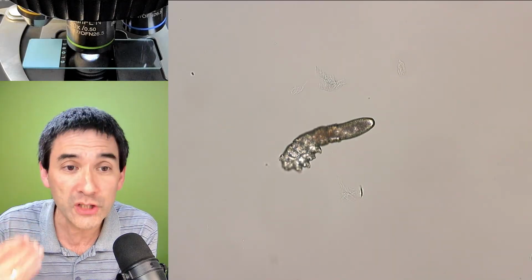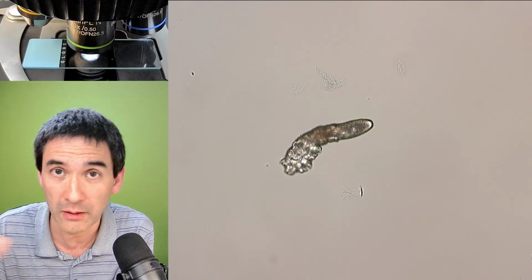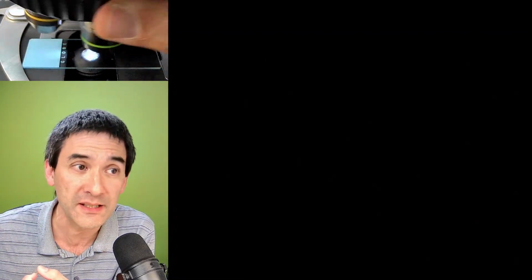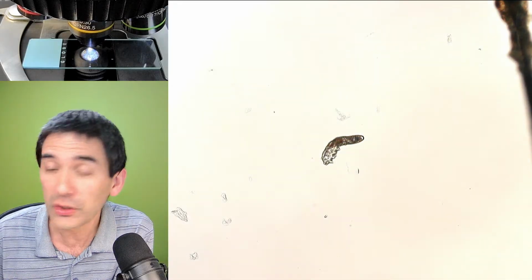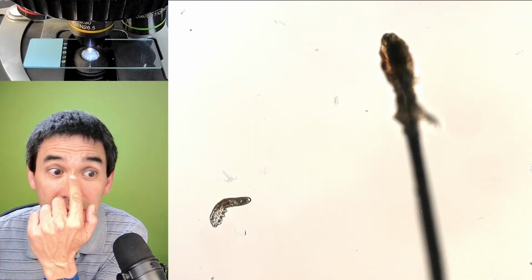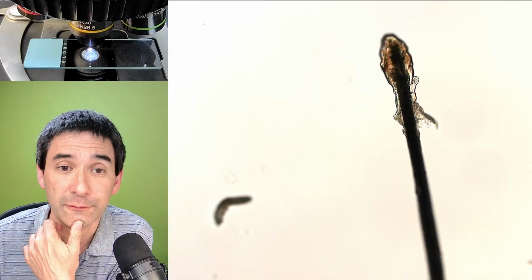Later on I'm going to show you everything from the very beginning. But just so that you understand a little bit how big it is, this is now the 10 times objective. I have to go down a little bit, and what you have over here is a hair. That's one of my eyelashes. Just so that you see a little bit the size difference.